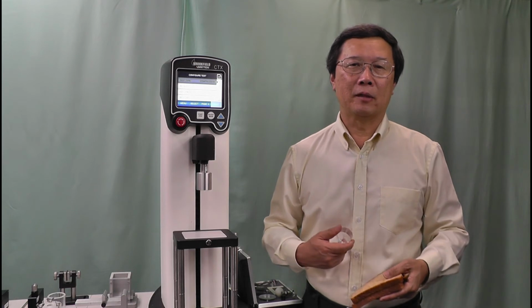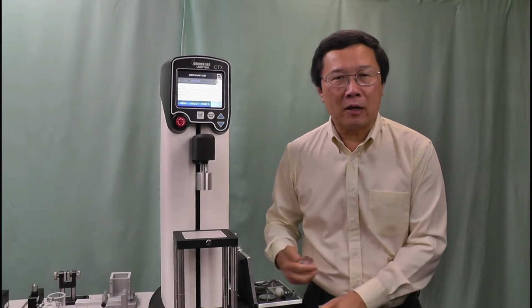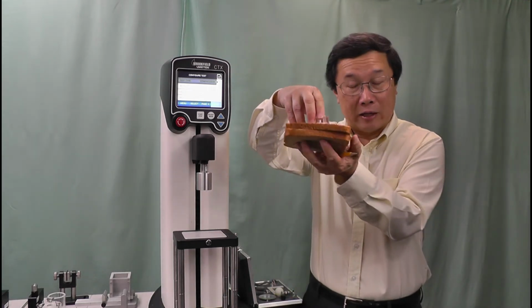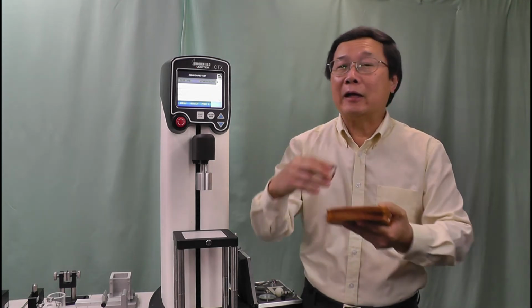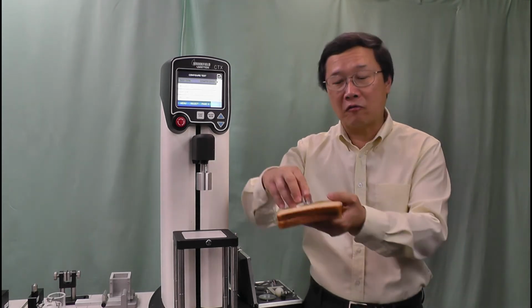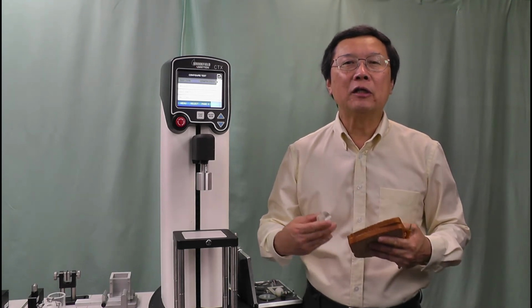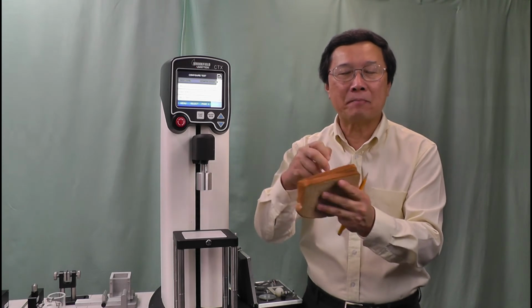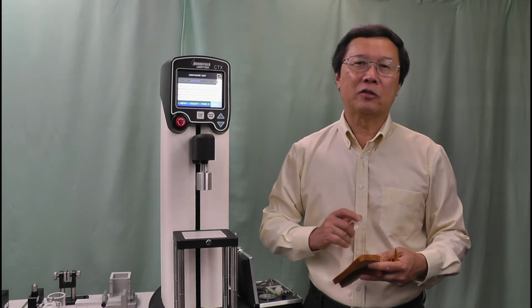Now, the other variable that you need to consider is deformation, which means how far you want to deform. When you deform to a target distance of say 4 millimeter and 6 millimeter, they are two different values, because a 6 millimeter distance will require more force compared to a 4 millimeter. So you have to determine at what distance. Usually, do not compress more than 60% of the total height of the sample because you may end up compressing the table. It's called the base effect. So you need to avoid that.